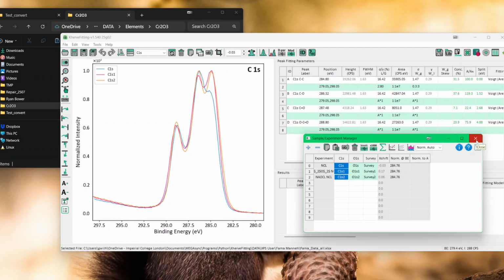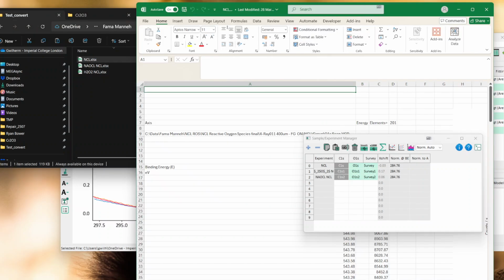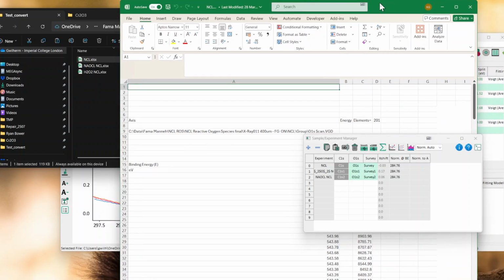Then another feature that was added is the conversions. So you can now convert samples not just one at a time. So this is an Avantage file, for example, but it could be an MRS file. It could be something with single plots. So this is a single file made from Thermo Avantage and having these core levels.